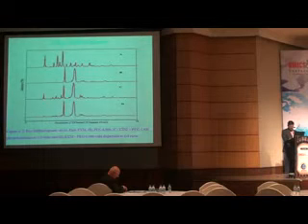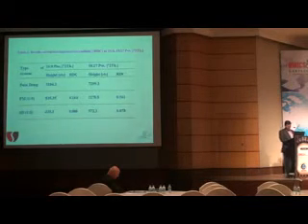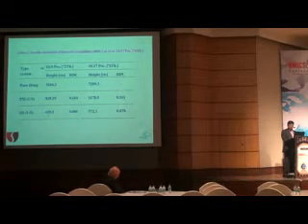solid dispersions, and saturation solubility studies showed, as we see here, that the solid dispersion in 1:9 ratio showed an improved solubility. The differential scanning calorimetry for solid state characterization suggests that the drug peak was there in A, that is figure A, and when you see B, C and D, B is pure ebastine, C is ebastine PEG physical mixture, and D is ebastine PEG 6000 solid dispersion. We could not find this peak in the solid dispersion, which suggests that it transformed.